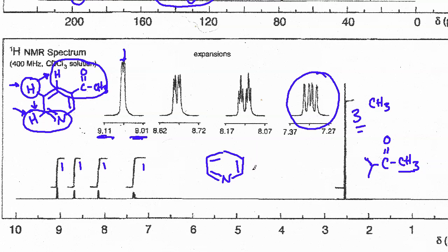All right, so the reason that I would propose that this is in position 3 and not in position 2 is that if it were to be in position 2, meaning right down here or right here, these 2 protons would both probably start to cluster together. So this proton here and this proton here. And that's because these 2 protons right here would be close to the electron withdrawing groups. So you'd have this one and this one. They'd be further downfield. They'd be at higher ppms.